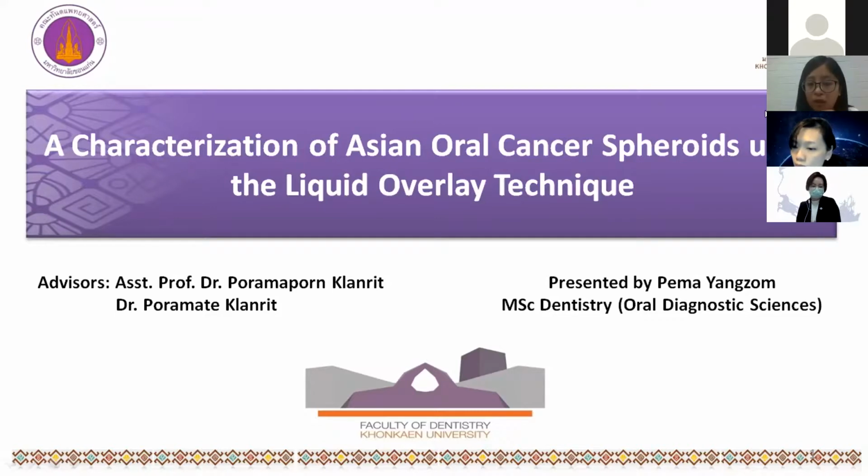But when I observed 2,500 and 5,000 cells, they show increasing growth. So yes, this is the difference I observed. So can I say you found the subculture level, that it cannot exceed 10,000, and you have to subculture to expand? Or because it stopped expanding, maybe it means subculture?